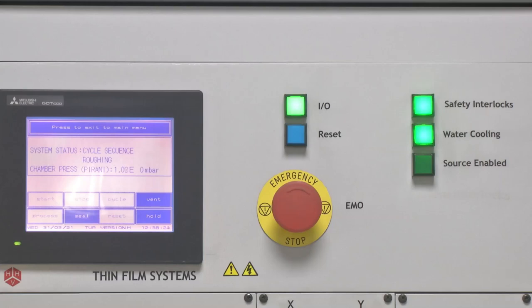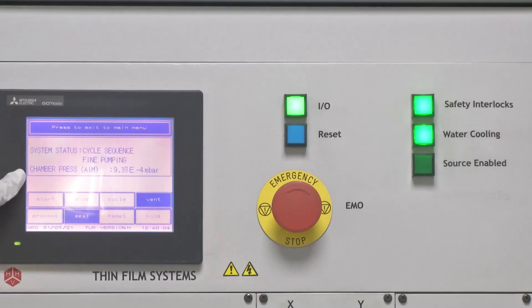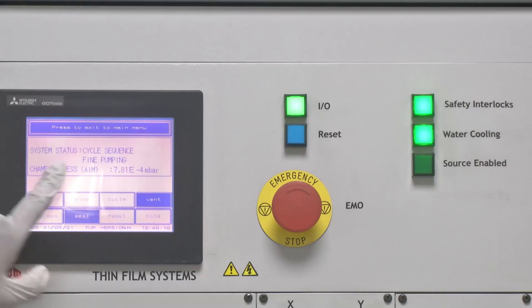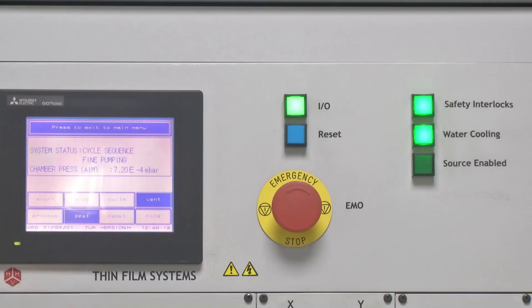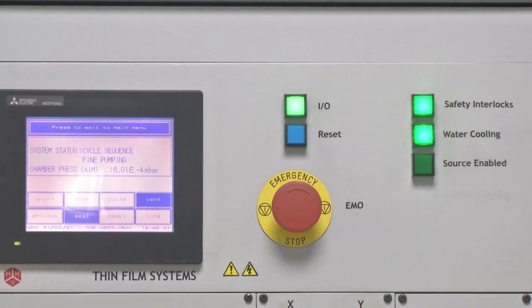The vacuum has now dropped to 10 to the minus 1 millibar, and the chamber pressure has reached 10 to the minus 4 millibar. The system status has changed to 'cycle sequence fine pumping,' which means the turbomolecular pump is now working — the backing valve is open, the roughing valve is closed — to evacuate the chamber to the desired vacuum of around 2 to 3 × 10 to the minus 6 millibar. This process takes around 1 hour.